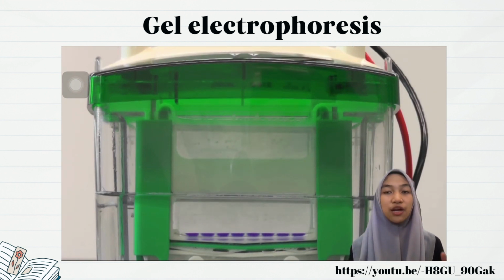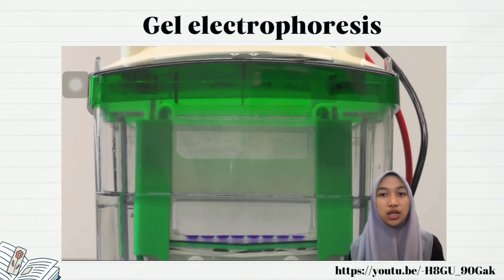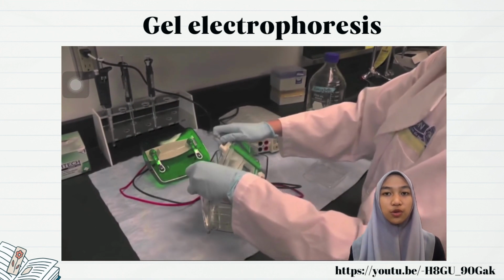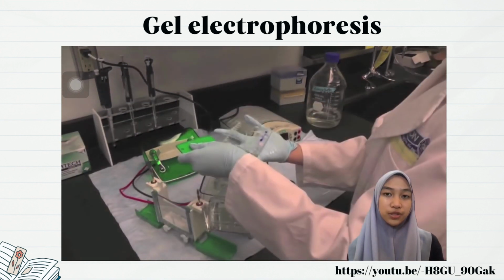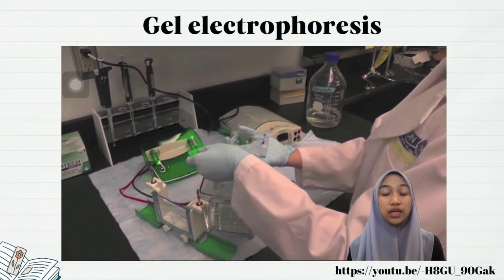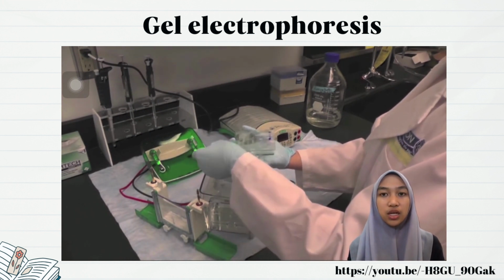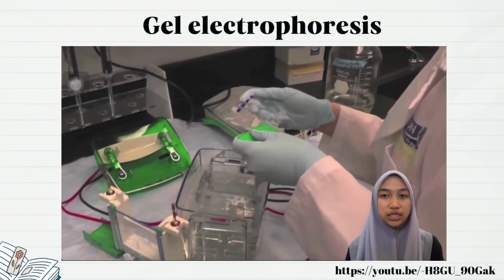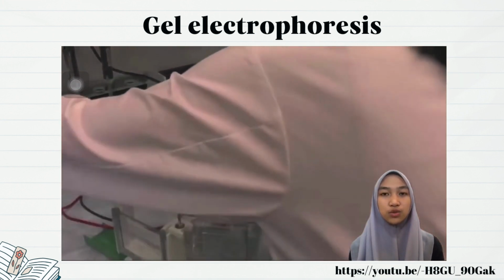When the blue dyes have reached close to the bottom of the gel, stop the run, unplug the power supply, then remove the running module from the tank and drain the running buffer. Remove the glass plates carefully from the running module, then carefully use the gel releaser to remove the gel from the glass plate. You can trim off the stacking gel carefully before proceeding to staining.